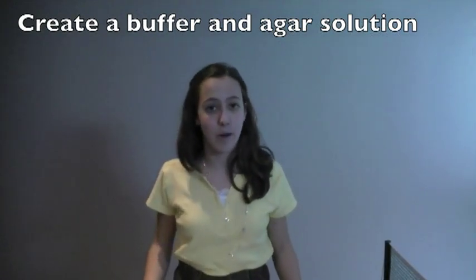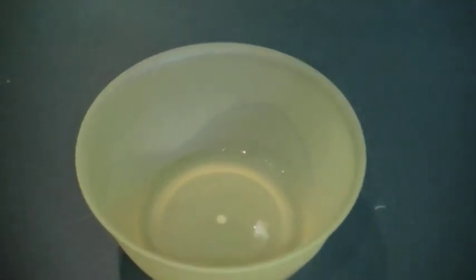We created a buffer solution from water and baking soda. We then added the agar solution to it and we will now heat it to make the right solution for our experiment.